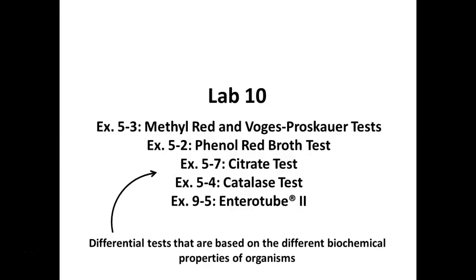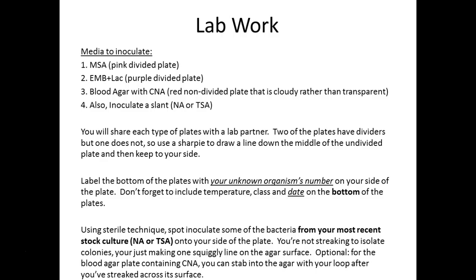So these are differential tests, based on their differential biochemical abilities, their functions, their physiology for your organisms.